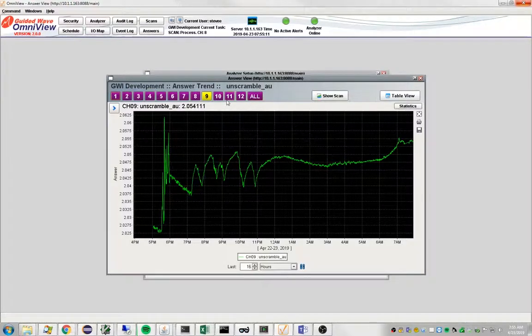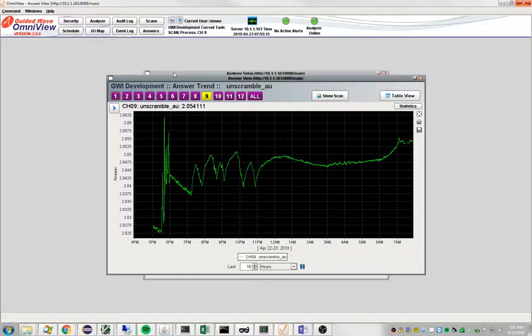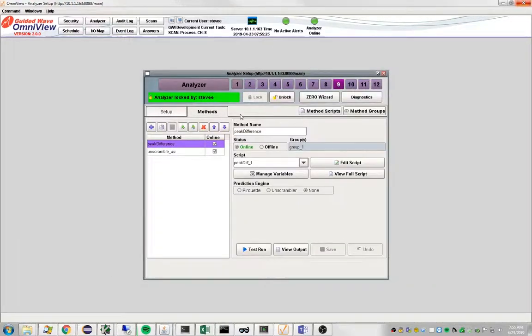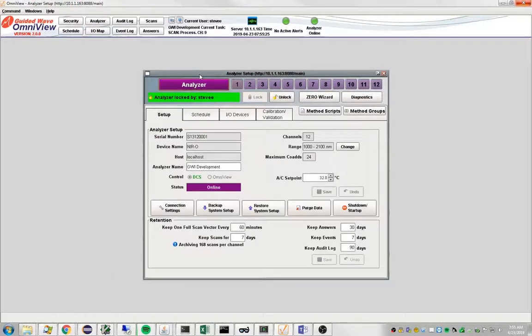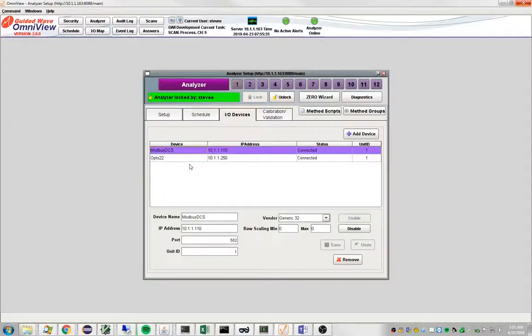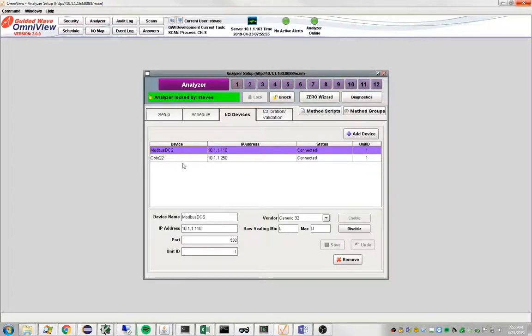Well the way you do that is by using input output. So if you go out to the analyzer and click on the IO devices tab, I have defined a couple of IO devices that I am simulating.